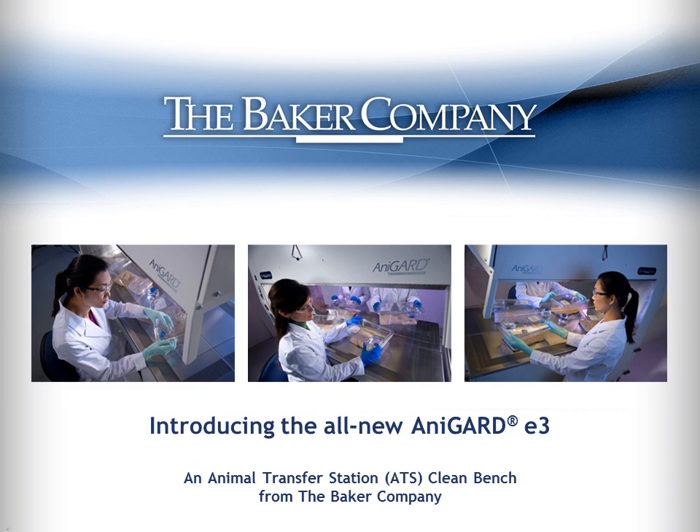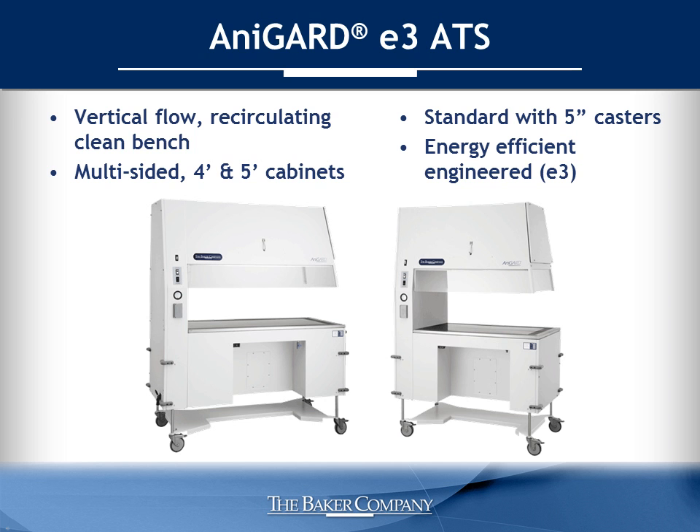The Baker Company is pleased to introduce the all-new AniGuard E3 Animal Transfer Station. The AniGuard E3 is a vertical, recirculating flow, clean bench designed to provide animal protection and particulate control during routine cage-changing operations. Offering improved containment and enhanced ergonomics combined with lower energy requirements, the new AniGuard E3 features unrivaled performance and protection with increased attention on workplace productivity and efficiency.